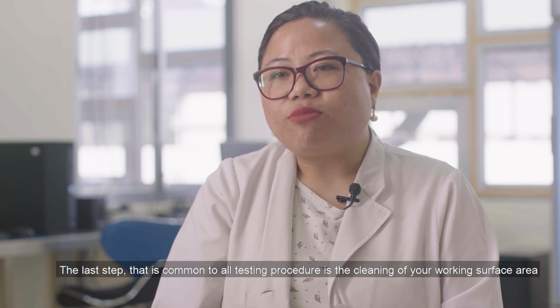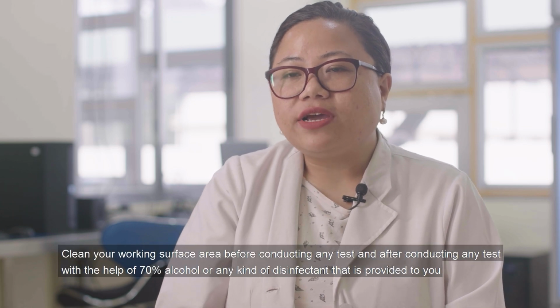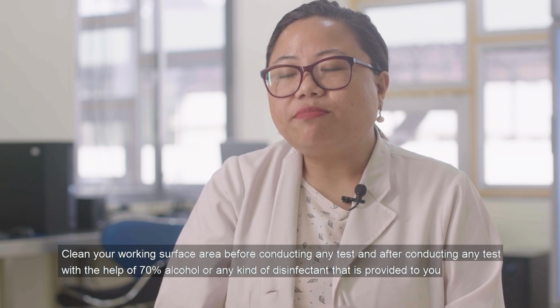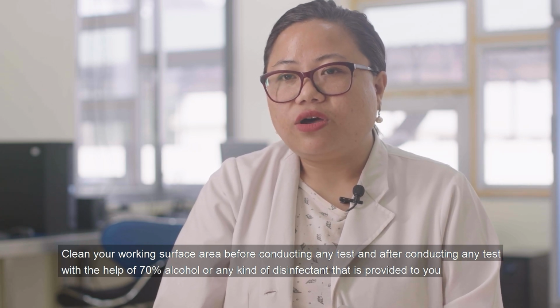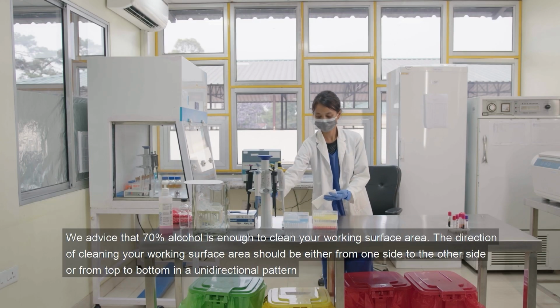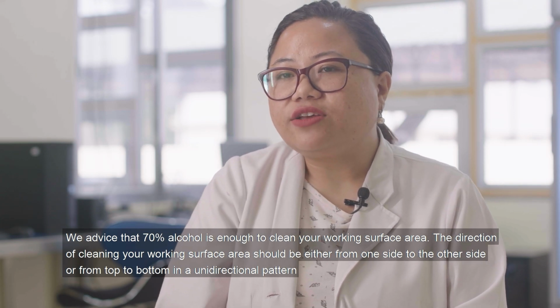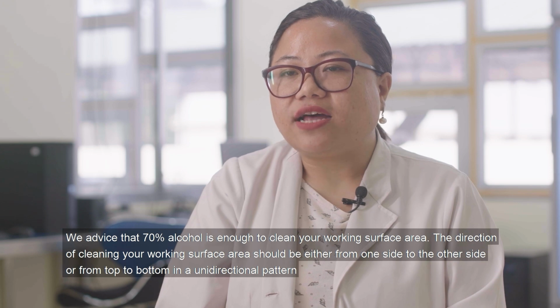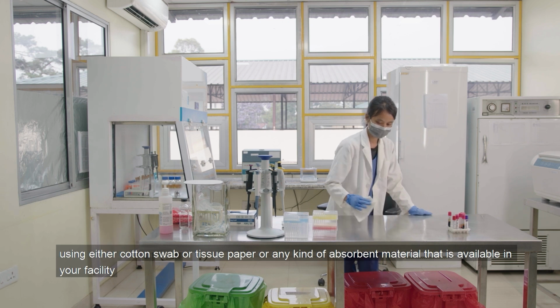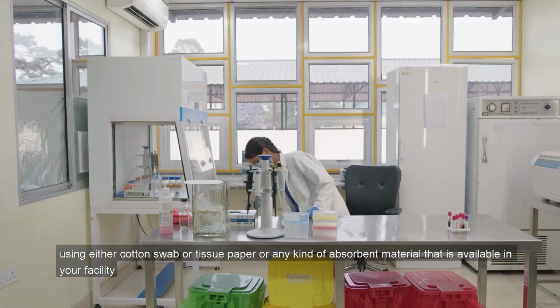The last step that is common to all testing procedures is the cleaning of your working surface area. Clean your working surface area before conducting any test and after conducting any test with the help of 70% alcohol or any kind of disinfectant that is provided to you. We advise that 70% alcohol is enough to clean your working surface area. The direction of cleaning should be either from one side to the other side or from top to bottom in a unidirectional pattern using either cotton swab or tissue paper or any kind of absorbent material that is available in your facility.